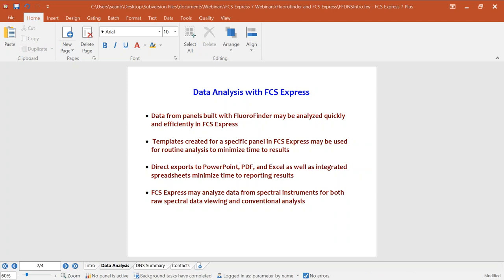FCS Express has what we call integrated spreadsheets. Imagine having the power of moving a gate and your results updating live — like in Excel — or your bar plots updating in real time. For spectral data analysis, FCS Express can analyze data from spectral instruments for both the raw spectral data and in terms of a conventional analysis, so you can access the raw spectral data when you need it while still using familiar workflows.